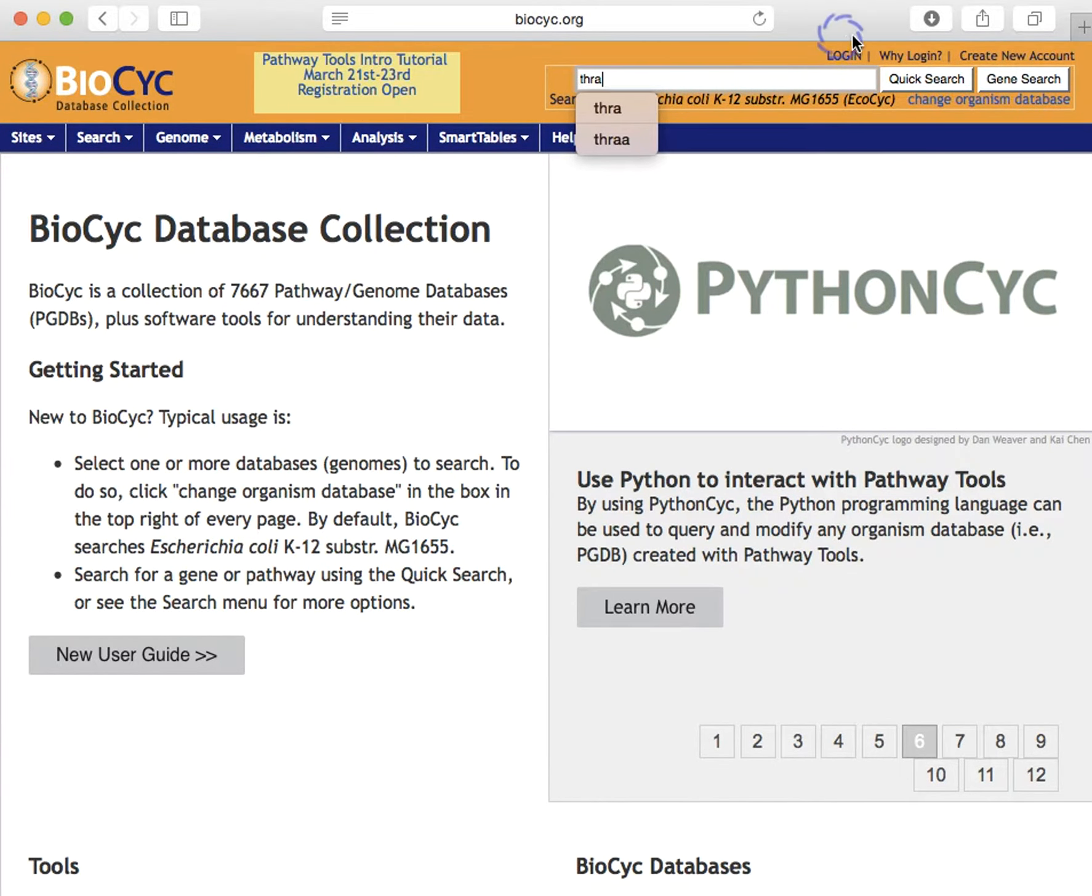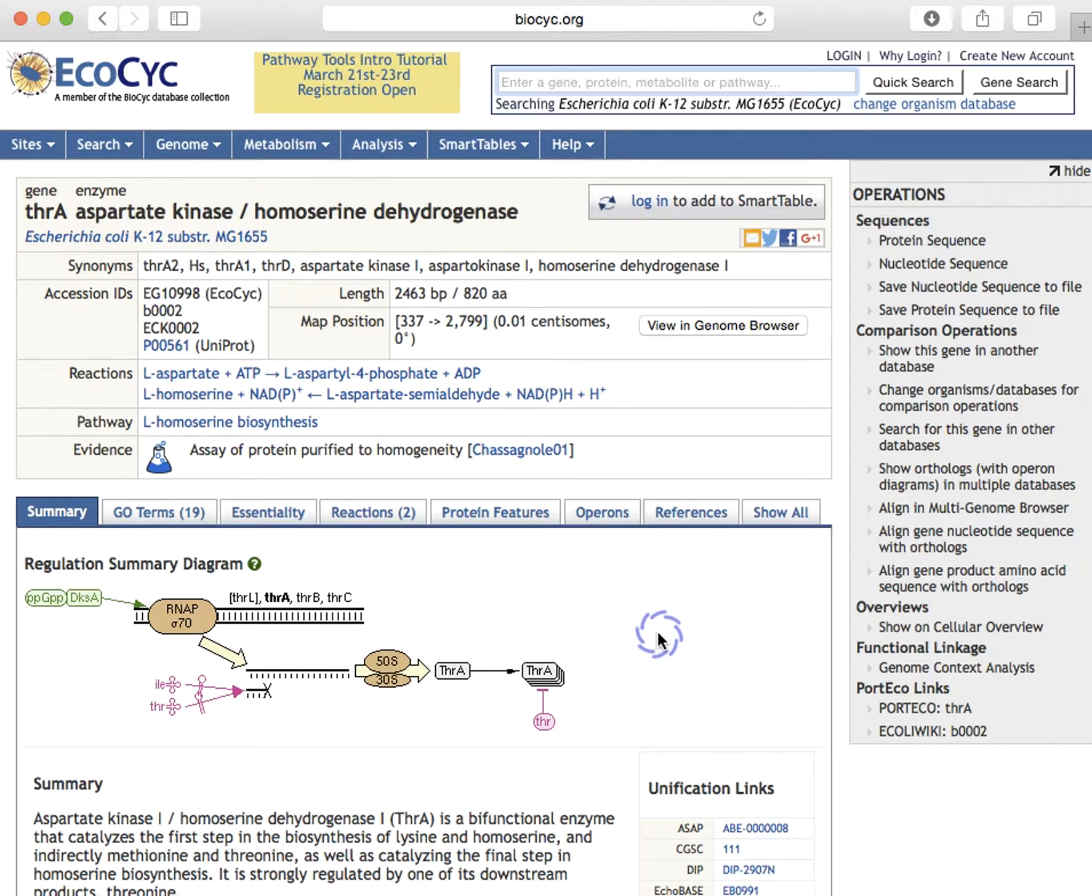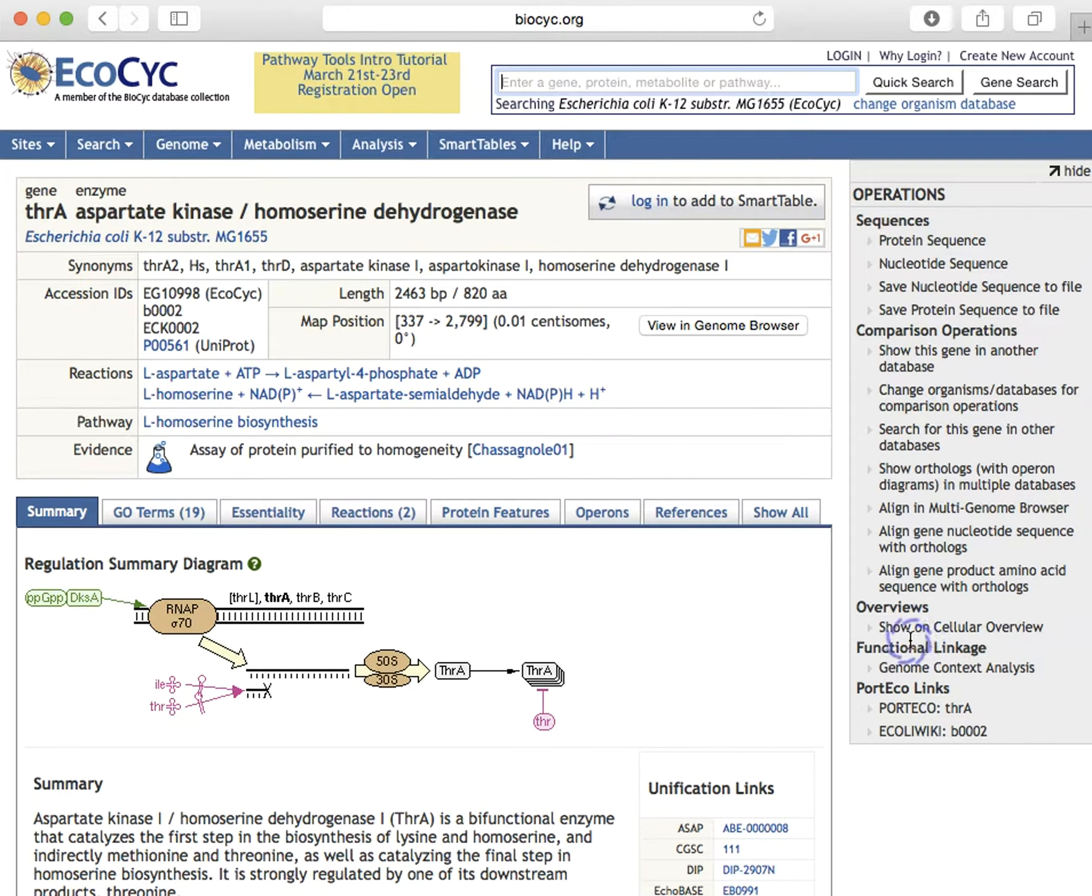The gene page is organized into three sections: the fixed upper area, the lower area that can switch between different information sections or panes, and the operations menu in the right sidebar.